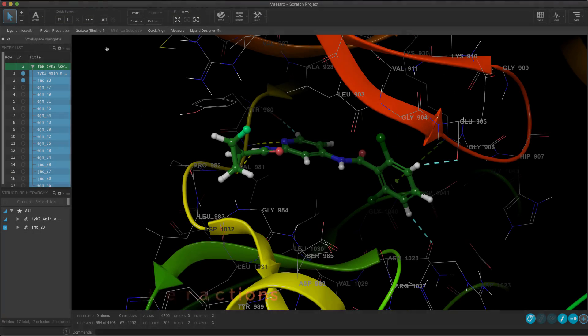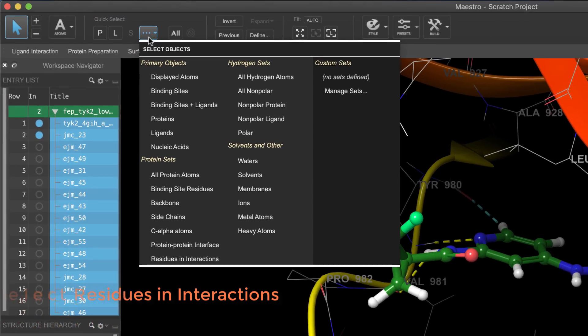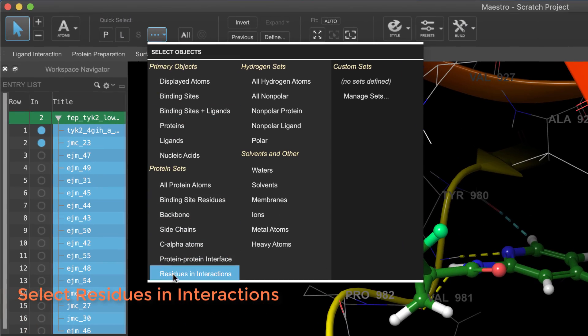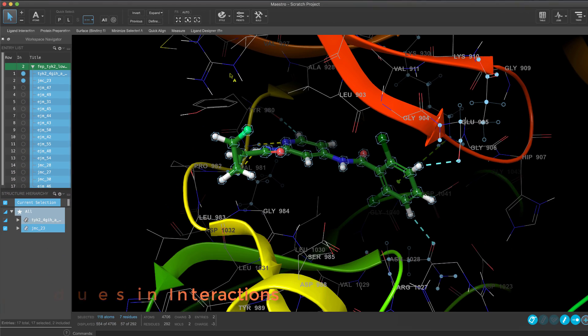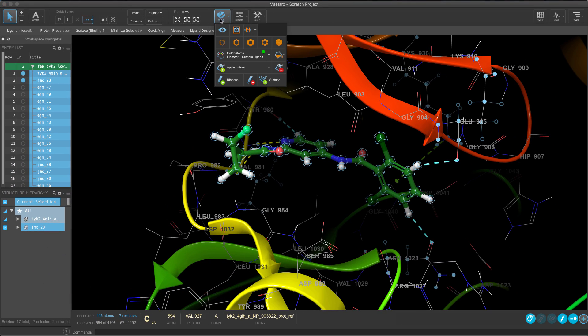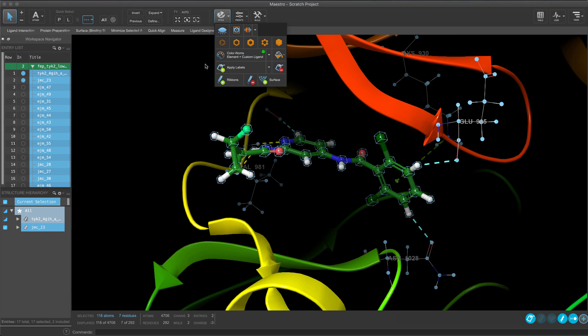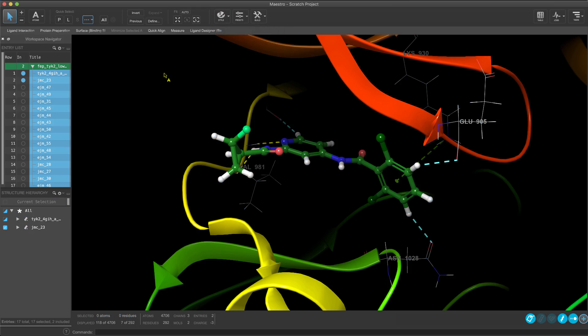Minor usability enhancements in Maestro include quickly selecting any visible residues involved in non-polar interactions. This can be useful for highlighting the key residues of interest.